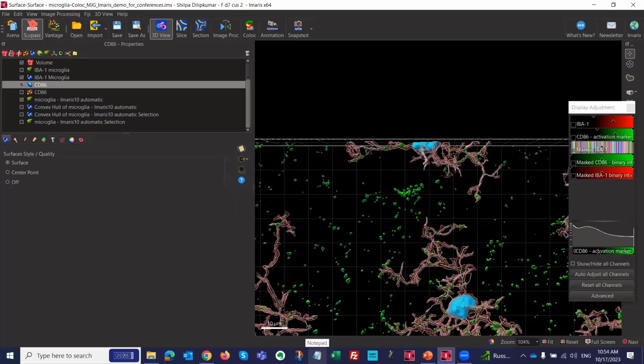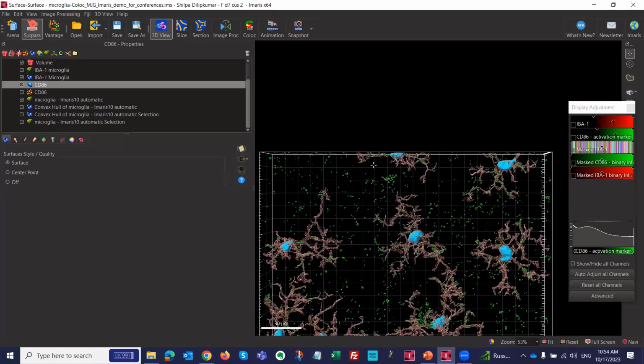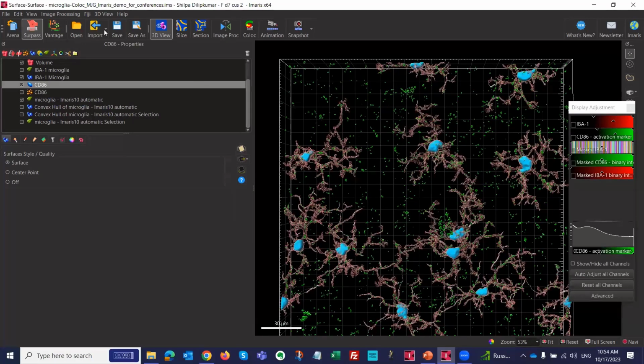Very nice basic question. When you open an image and you do all of this, does it get saved by default? When you open it next time, will you know everything you ever did to this image? You have to save it, and then we'll know everything you've ever done. Definitely never forget to save. You can do save, so it will override, or you can do save as. I typically start with one thing when I convert it and leave the converted default, and then I do save as, and I add underscore analysis or something. And it saves everything, all of those steps.